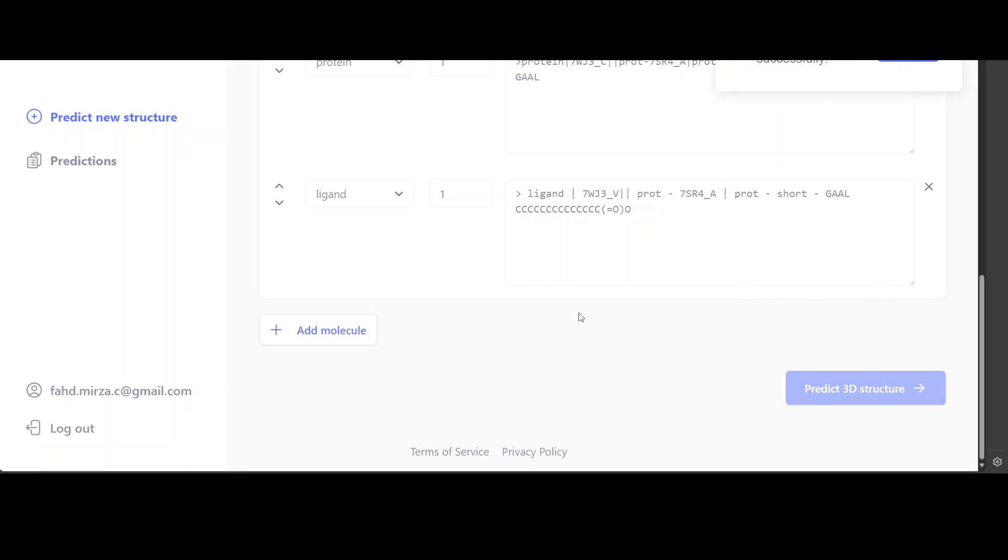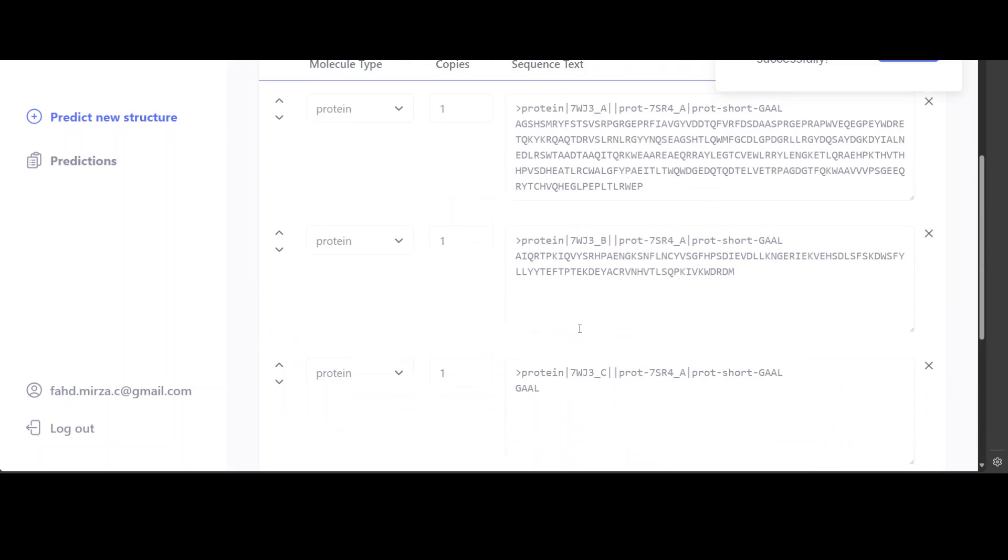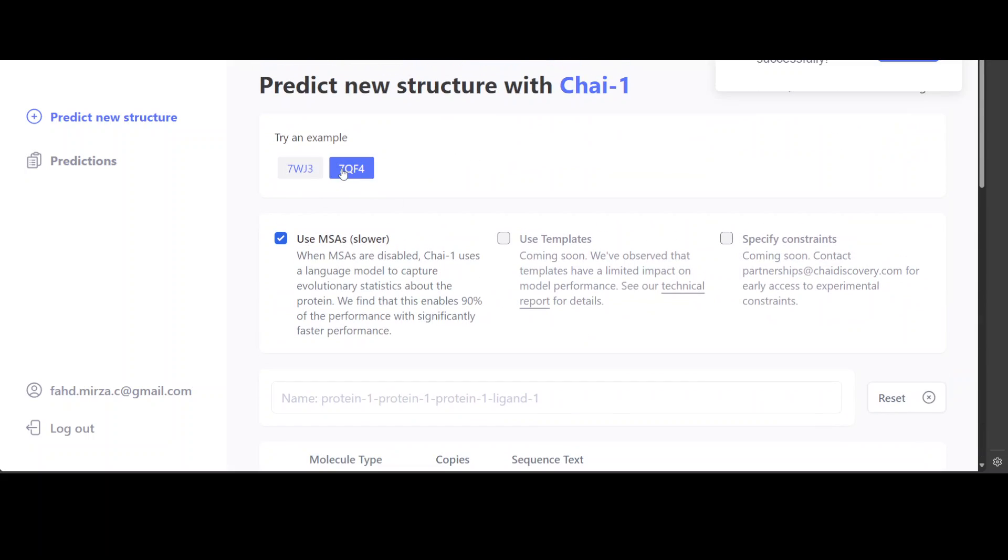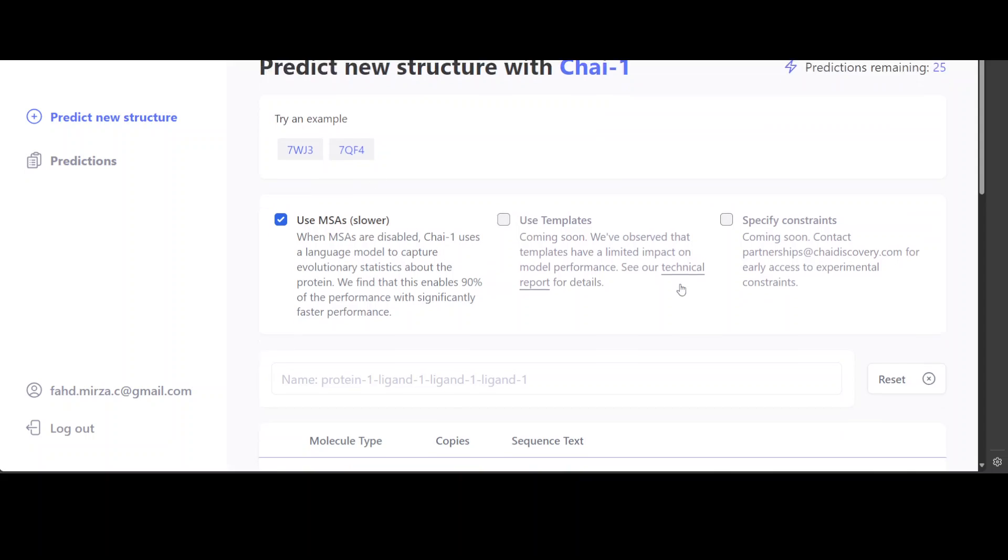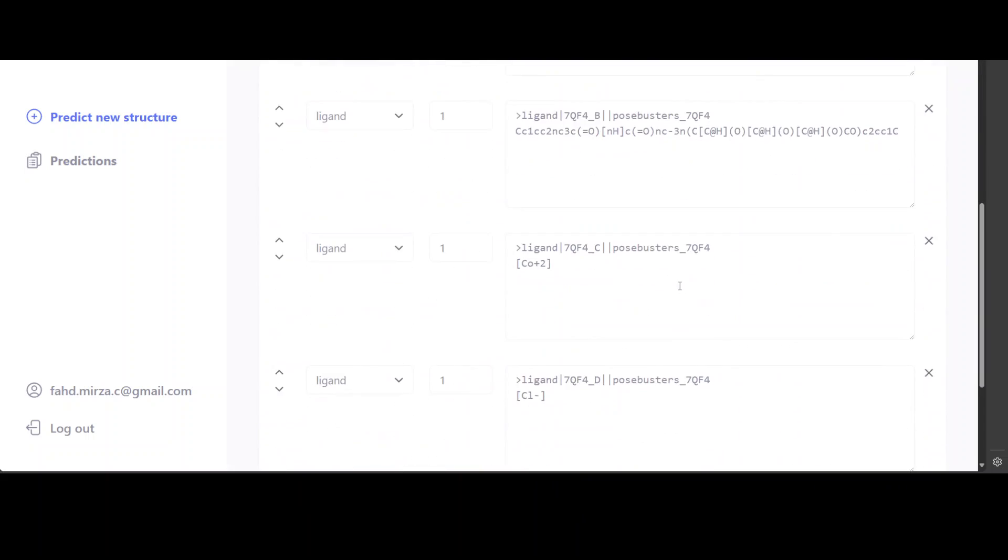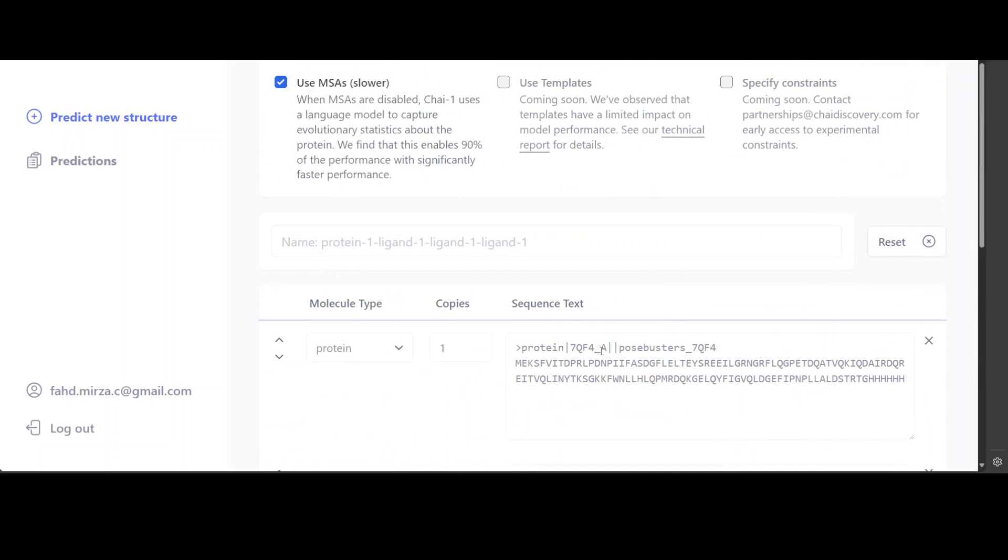Job has been created and it is going to take a bit of a time. Otherwise you can simply click here and then it is going to discard my progress, which is fine.